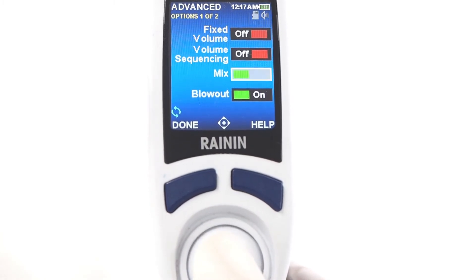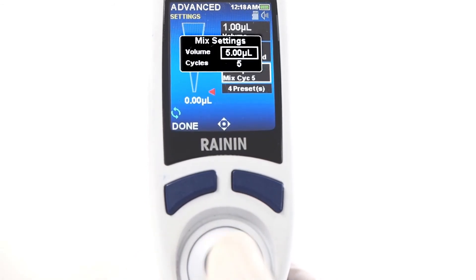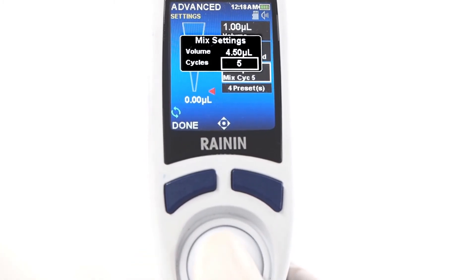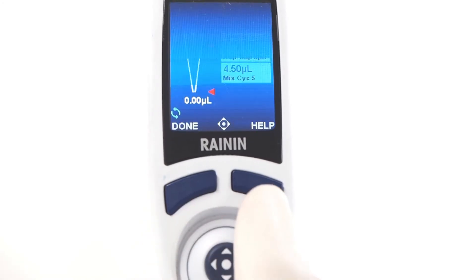Let's take mix as an example. Press in to turn it on, then press done. Joystick right into settings, move down to the mix box, and press. Here you can adjust mix volume and the number of cycles for your samples to automatically mix. Press done to set, and done again to exit settings.